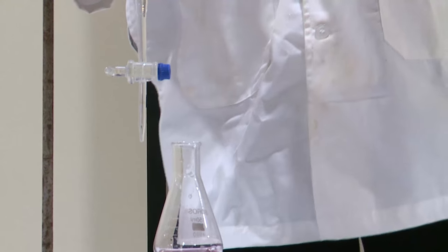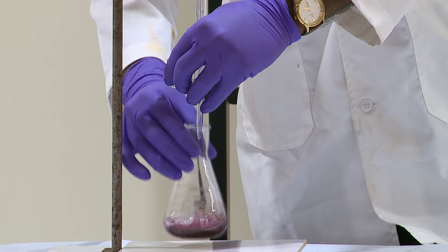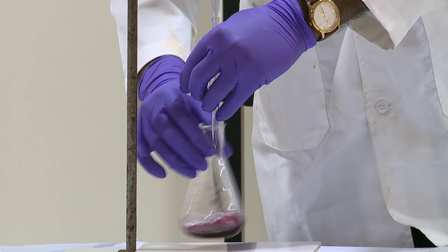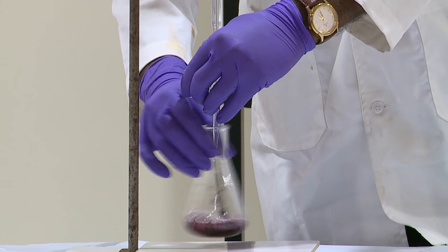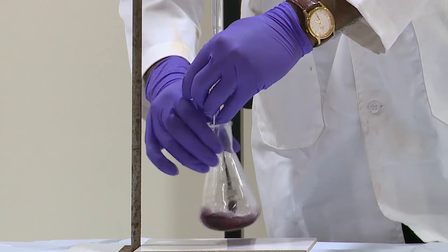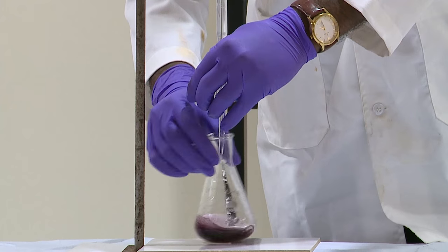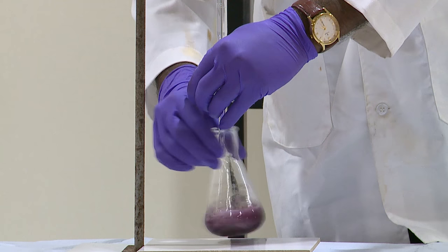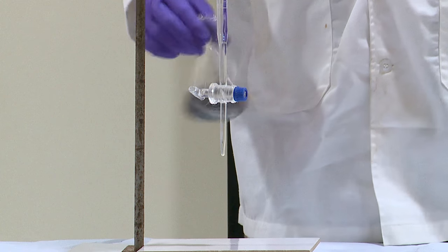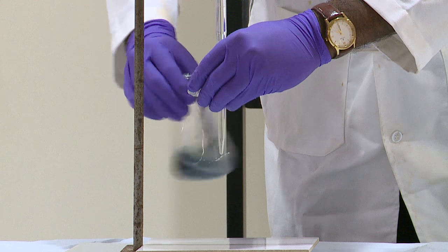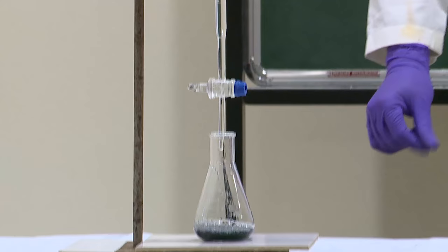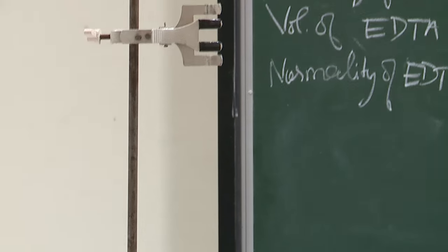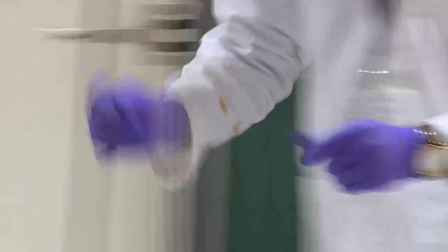Fill the burette with EDTA and start the titration. When you add the EDTA, the free metal ions complex with EDTA, and also the metals bound with EBT will be taken by EDTA. At last, when all the EBT is free from metal ions, you will see the color change. You have now got the color change — it is steel blue — this is the end point. Note down the value: the reading is 10.1 ml.